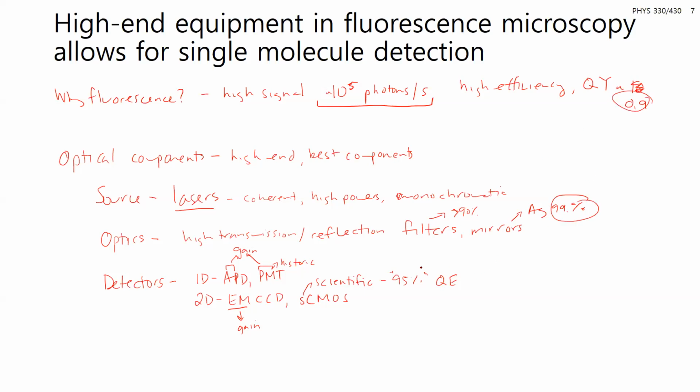So you can see 90%, 99%, 95%. These are all trying to use the best of the best, or as close to perfect as what is available now. And I'd say these numbers for the detectors was somewhat a limiting capability when this was being developed in the 90s. The detectors were the problem, and then now two decades since then, these high efficiency detectors are pretty routine.